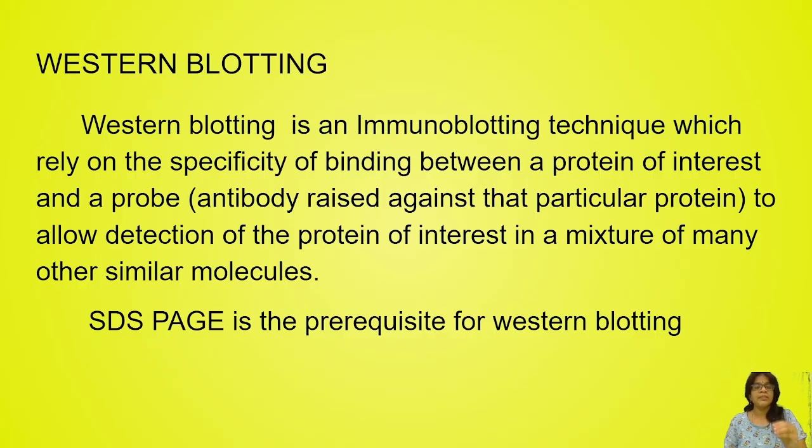Western blotting is also called an immunoblot, because you already have some idea what immunology is, right? Even the undergraduate students would. It's all about the immune system, where you come across antigen-antibody interactions. I will cover immunology in the last class or in some other class, because immunology is a very important topic. In that subject you will keep hearing about the Western blotting technique a lot. Western blotting is also called the immunoblotting technique, where you specifically detect a particular protein sequence or amino acid sequence by the blotting technique.